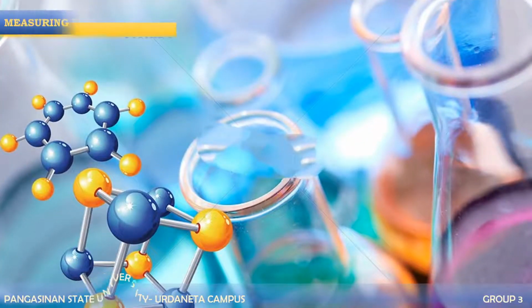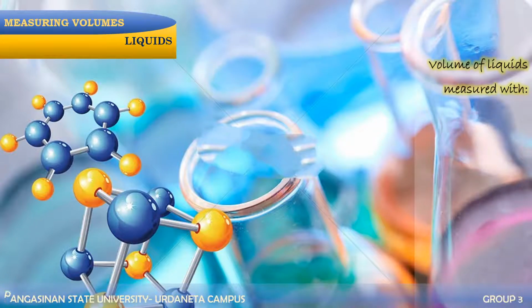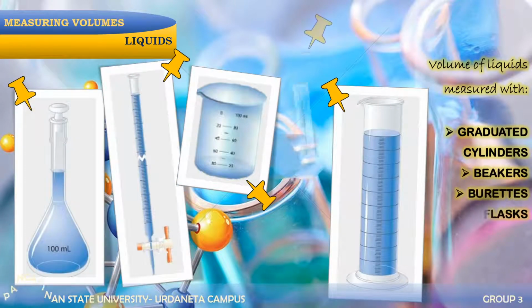I'm Mariel Collado and I'll start the presentation with an introduction of the instruments used in measuring volumes. Volume of liquids is most commonly measured with graduated cylinders, although beakers, burettes, flasks, and pipettes are also used.